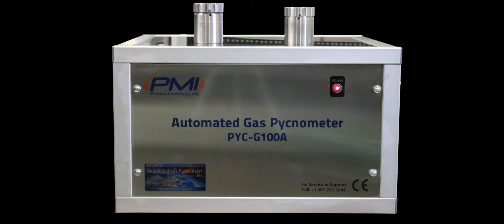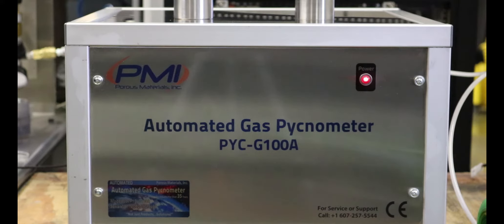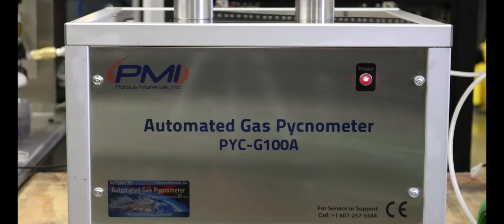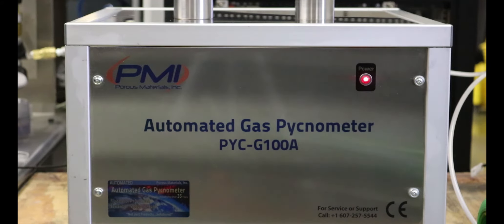This video will guide the user through a test process and the resulting report generation. Make sure the machine is plugged into a power source and connected via USB to a computer on which the PMI software has been installed.